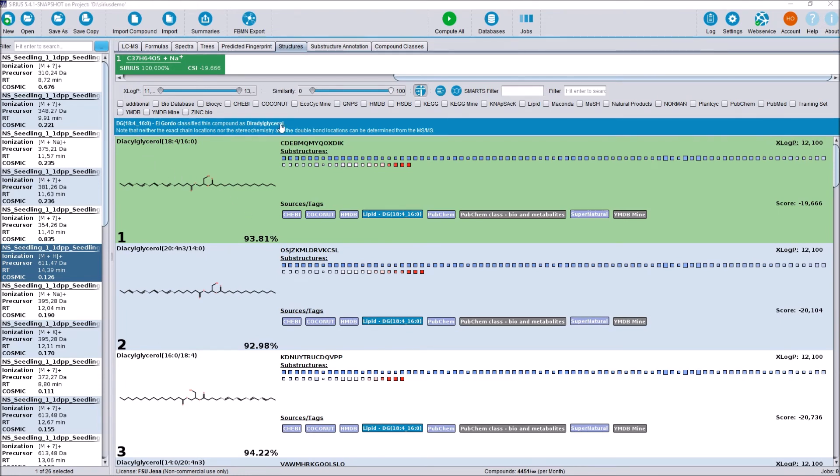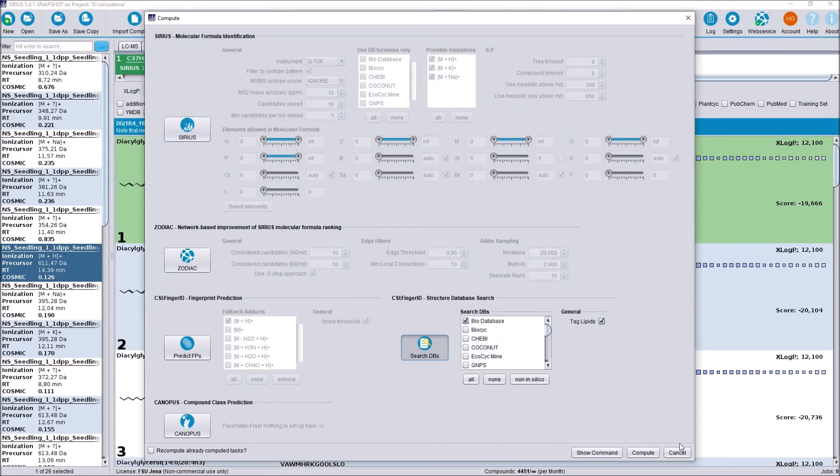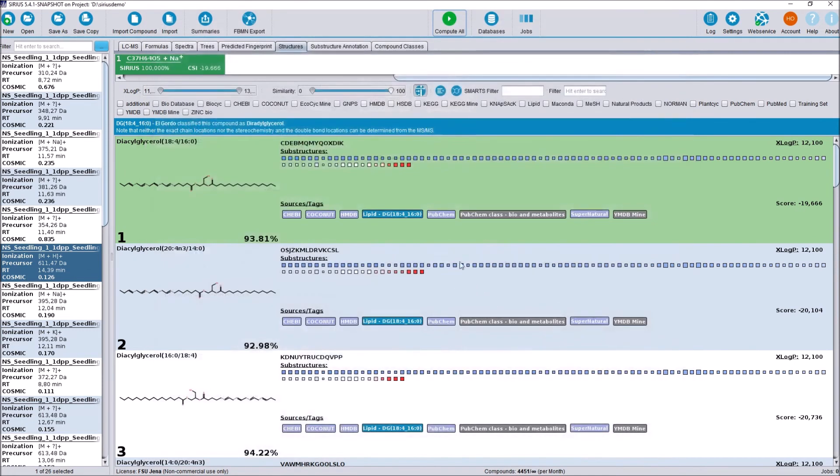And this difference is often indistinguishable for CSI FingerID and mass spectrometry in general, which is why we also report the lipid class up here for lipid-like compounds. And if you remember, in the compute dialog here, we had the option to tag lipids, which we did. And enabling this checkbox will make it so that every structure here that belongs to the lipid class gets a small tag here that corresponds to this class.